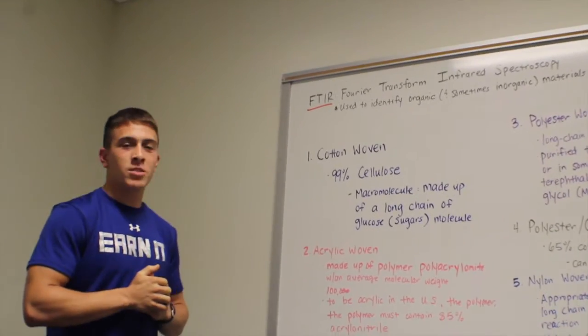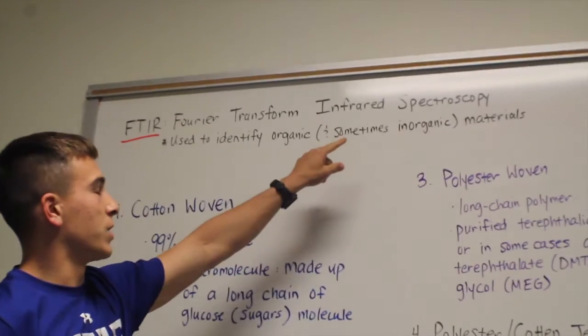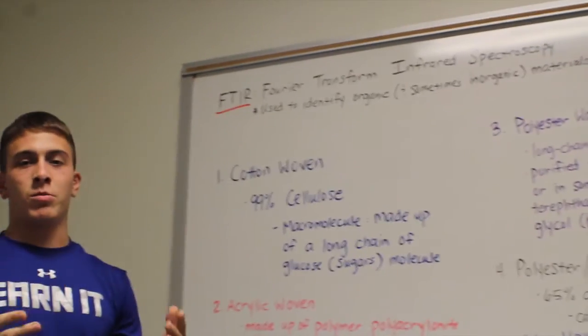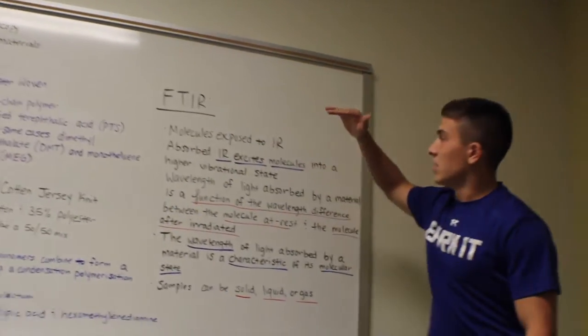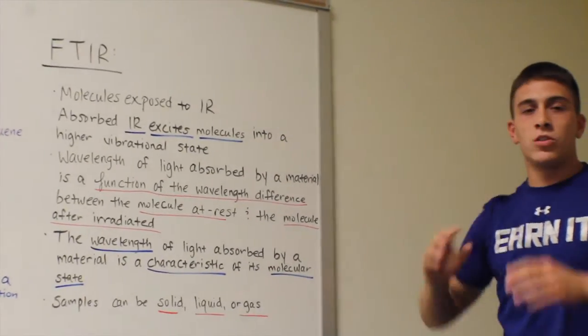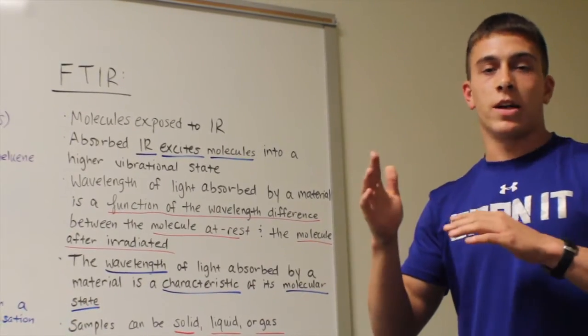Alright, so our testing method was FTIR, which stands for Fourier Transform Infrared Spectroscopy. It is used to identify organic and sometimes inorganic materials. FTIR does this by exposing molecules to infrared radiation, and these molecules get excited and vibrate more than they would at rest.